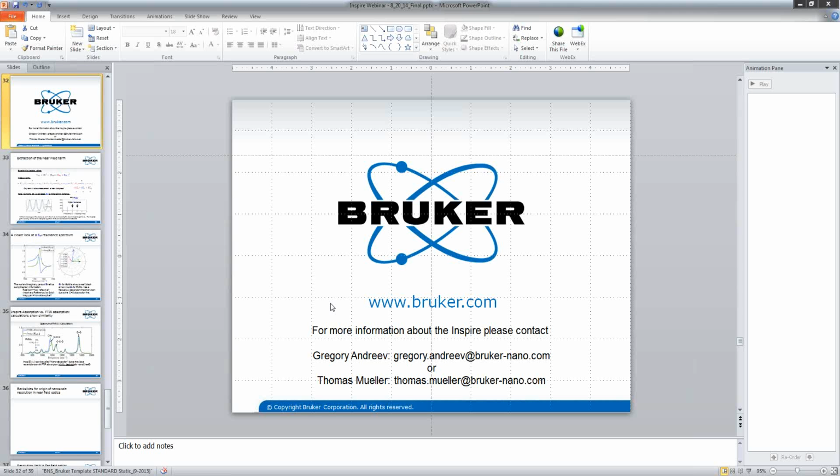And a question came in early on detecting differences in doping. I think you showed you can detect differences in doping. Yes, it depends on the semiconductor, but in silicon, I believe it was demonstrated that one could detect the difference between 10 to the 19 and 10 to the 20.